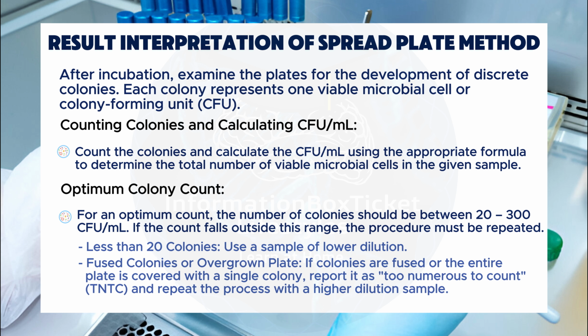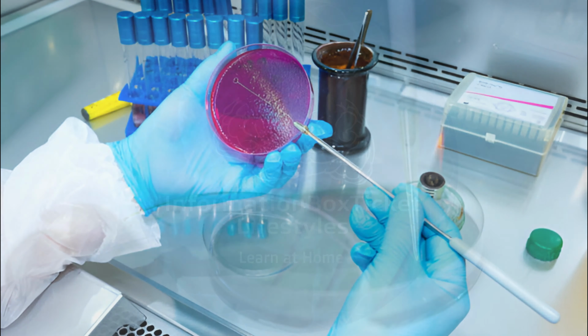Fused colonies or overgrown plate. If colonies are fused or the entire plate is covered with a single colony, report it as too numerous to count, TNTC, and repeat the process with a higher dilution sample.